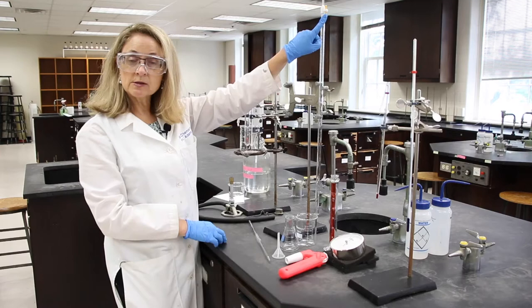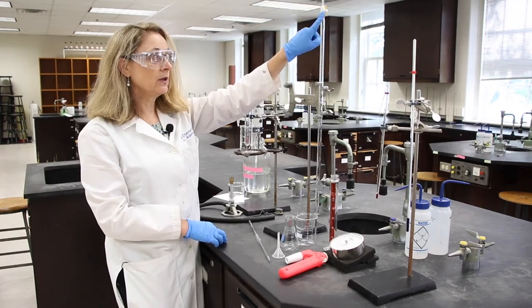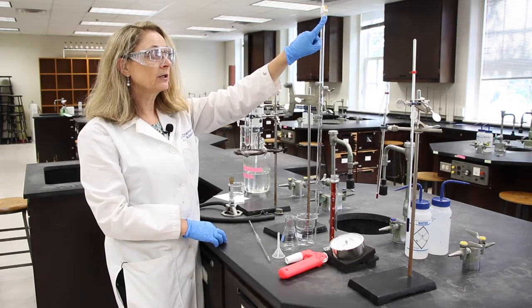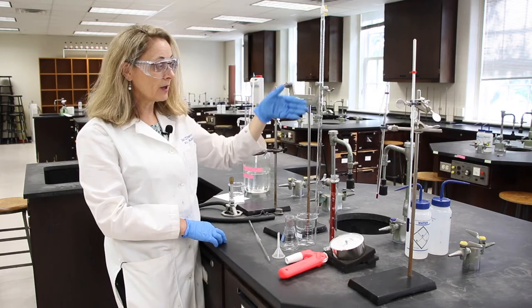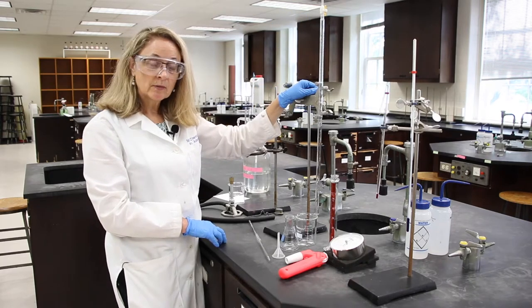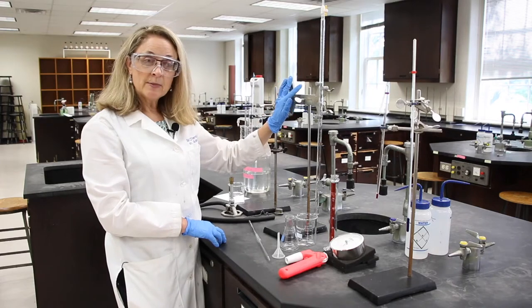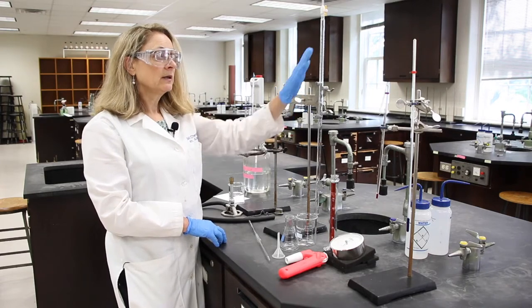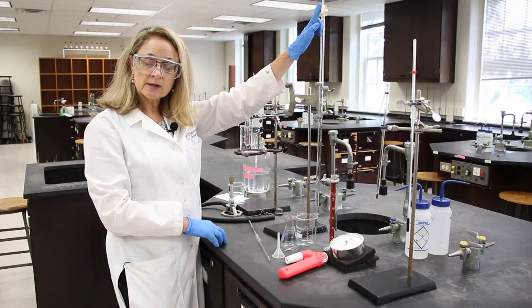And the stopcock is open, so the stopcock is parallel with the barrel of the burette, that signifies a clean burette. And before we leave lab, we always want to clean it, flip it, and open the stopcock.